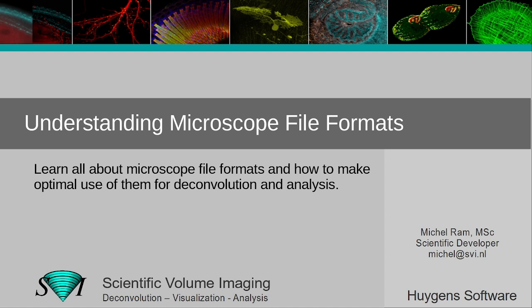I will cover topics like bit depth and dynamic range, file compression and conversion, but I also would like to take this moment to stress the importance of saving your microscope's metadata, as this can be vital in performing reproducible deconvolution and quantitative analysis.